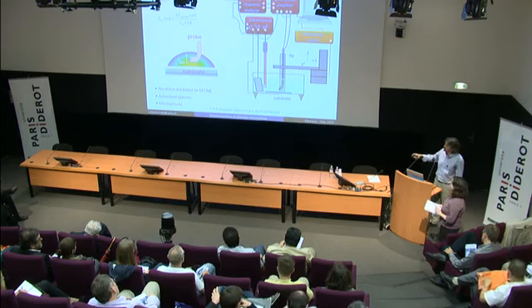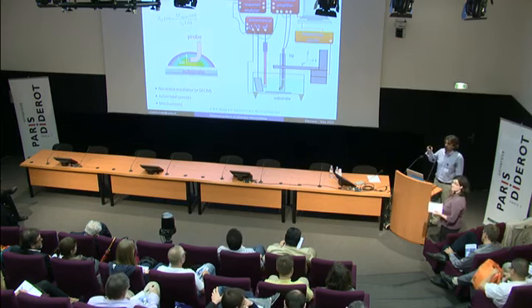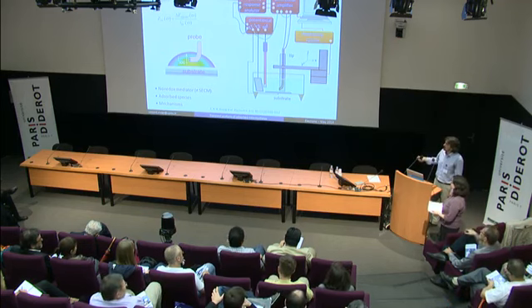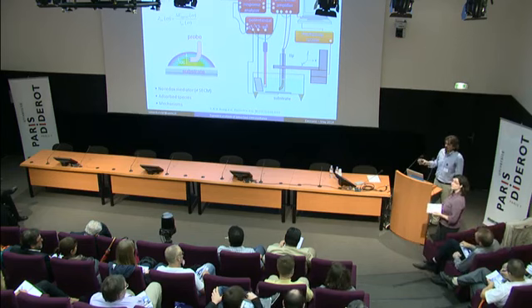Yes, but that's my question, in fact. When you are performing this kind of measurement with a small probe, you have to bring your probe closer and closer to the interface. I think that the resolution for the scanning electrochemical microscope for this kind of setup is about the size of the probe. For the local impedance technique, it's not exactly the same problem. Here it will depend on the distance between these two probes because we sense the potential difference in solution. And this is indeed the main problem. So here we cannot go to a value smaller than 1 micrometer for the spatial resolution.